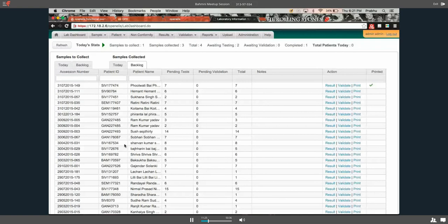Yeah, the reason why I asked is that we have a principle that most of those quick tests have a 3-hour turnaround, and we need that because our patients come a long way and we need them to be processed completely in one day, because they may have traveled a day or two to get here. So we have an expectation that all of the tests, other than cultures and things that take 3-5 days, have a turnaround of about 3 hours.